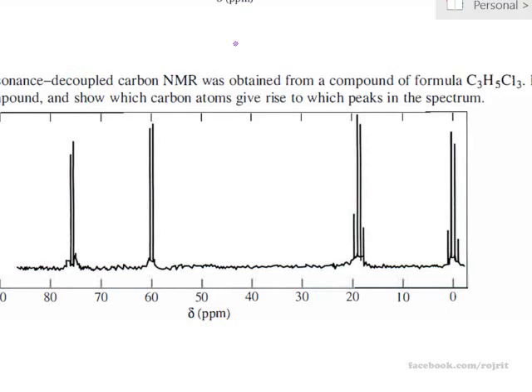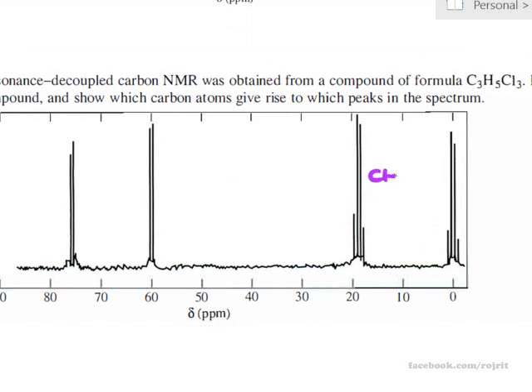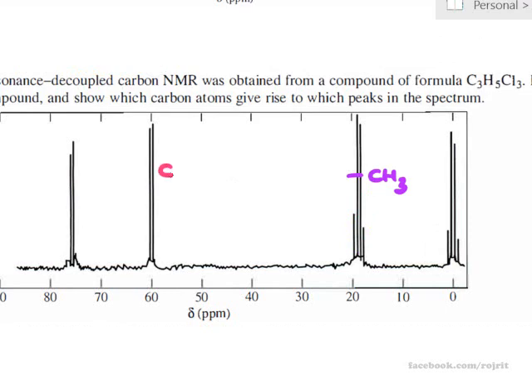So as you can see, we have a quartet here. The quartet symbolizes CH3, indicating the CH3 in the molecule. We have 3 carbons. We have CH3 already. And then we have the pink color, CH, because this position is a doublet, so you have only one hydrogen atom connected to your carbon. And then the yellow color over here is a doublet again, so we have CH, right?